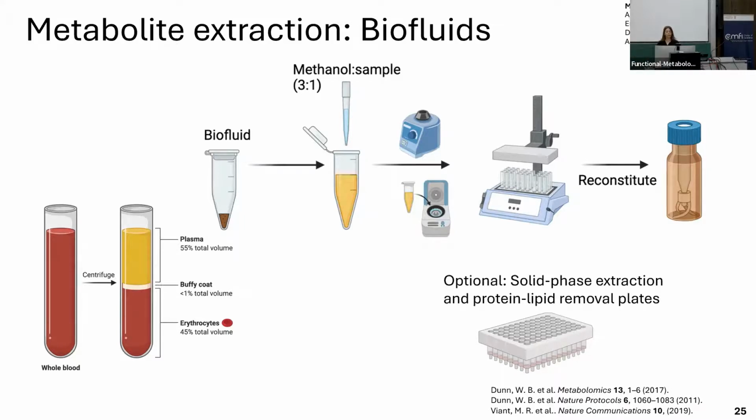And you take out this eluent anyway. Now for my data, and I think if you test that, you will also be positively surprised that it helps a lot with removing ion suppression from your MS data. But we will talk about it a little bit later. Some of you probably know what I'm talking about. So usually I am able to remove salts and some sugars from my media that are pretty nasty, and then really my data looks so much better in the end. But of course, solid phase extraction could also be used for single samples. They also sell just single columns that you can use, just way less data in general.